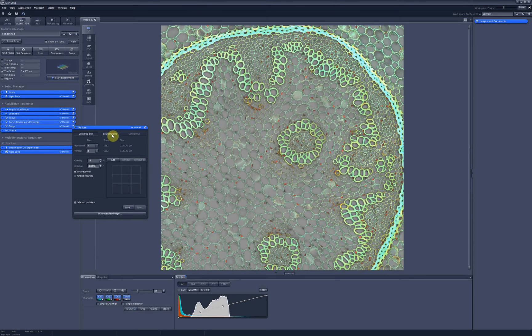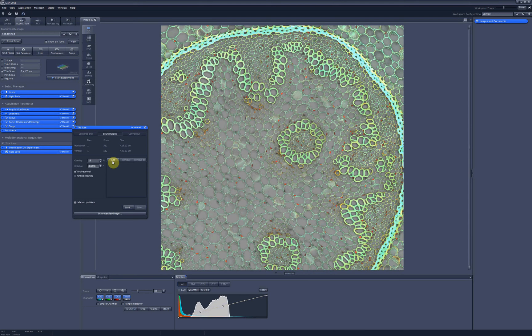Bounding grid is a very helpful option. The software asks you to define the margins of the area you are going to scan, and then it automatically calculates how many tiles you are going to need to cover this area.